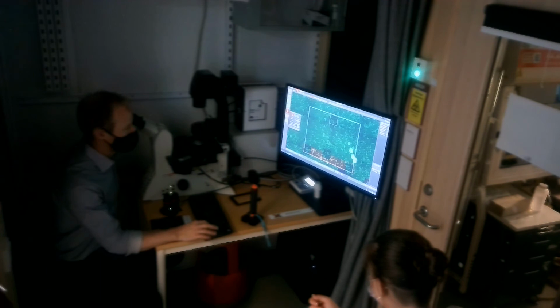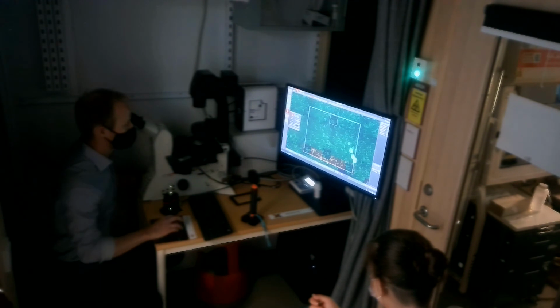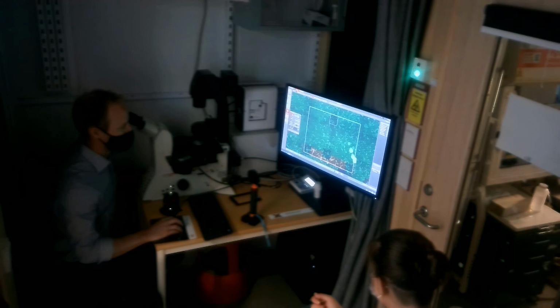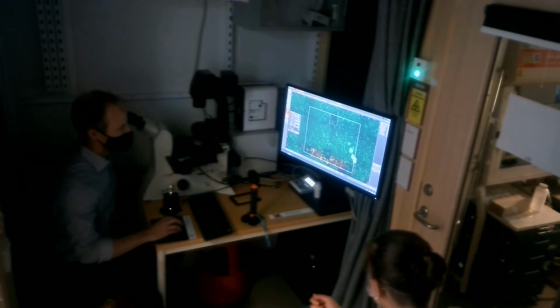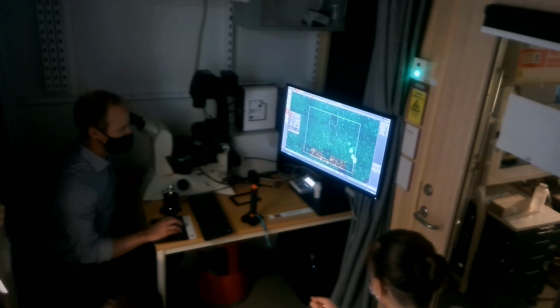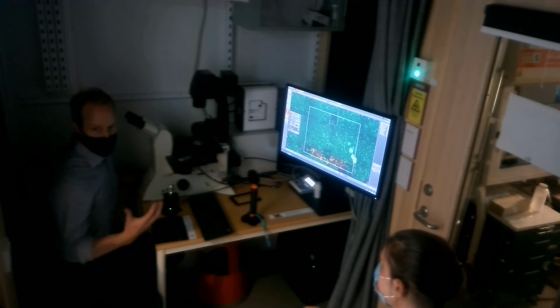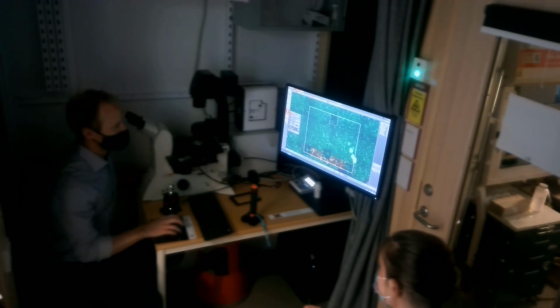But I will now put this one to 25. We have the precision again, speed or accuracy. Here we can even see the number of frames it will do. If I go a little bit more towards accuracy, it will do 9 steps and so on. You can also select how many steps you want it to do in this range. So that's setting up the actual process of where it's looking for the focus.